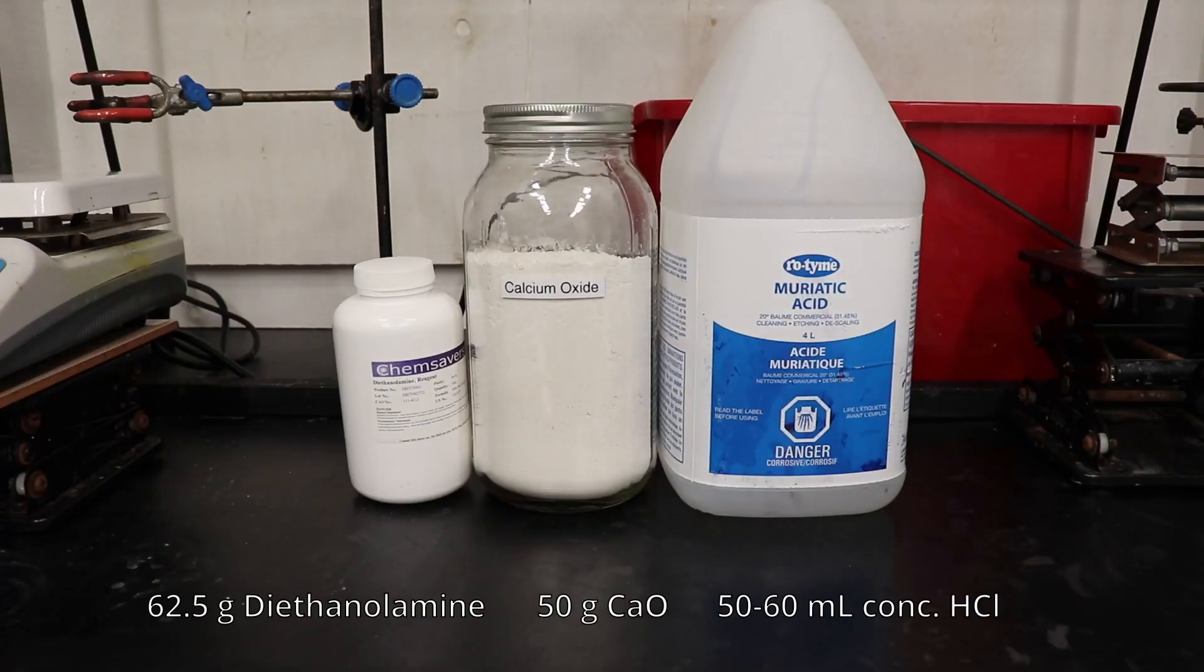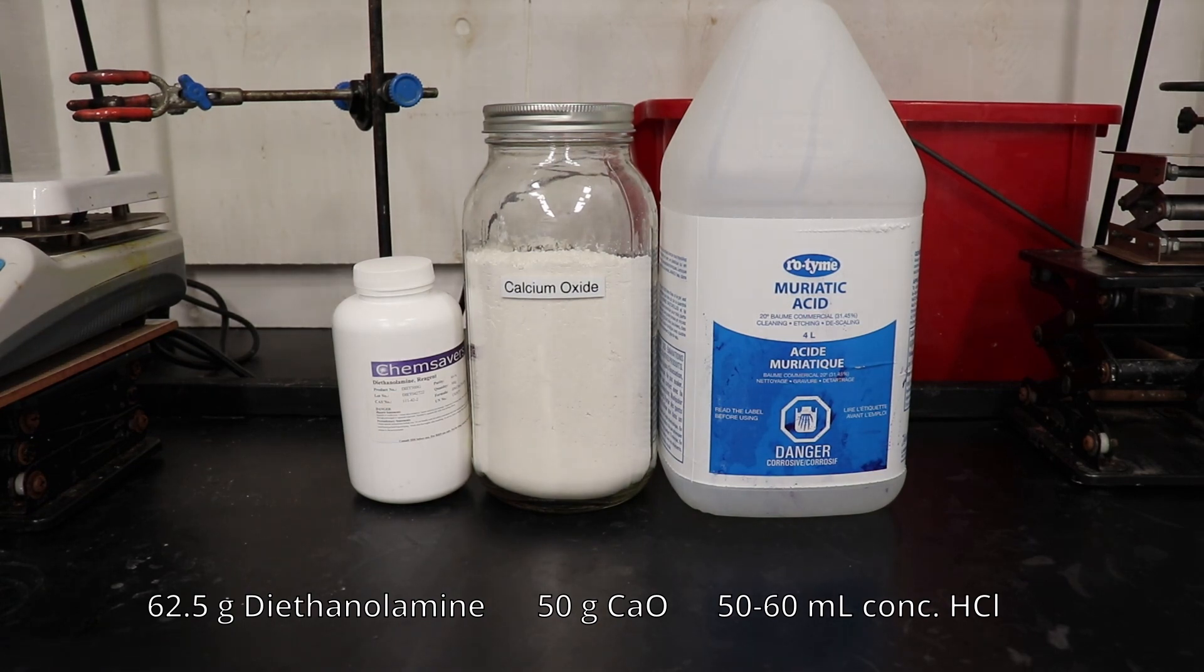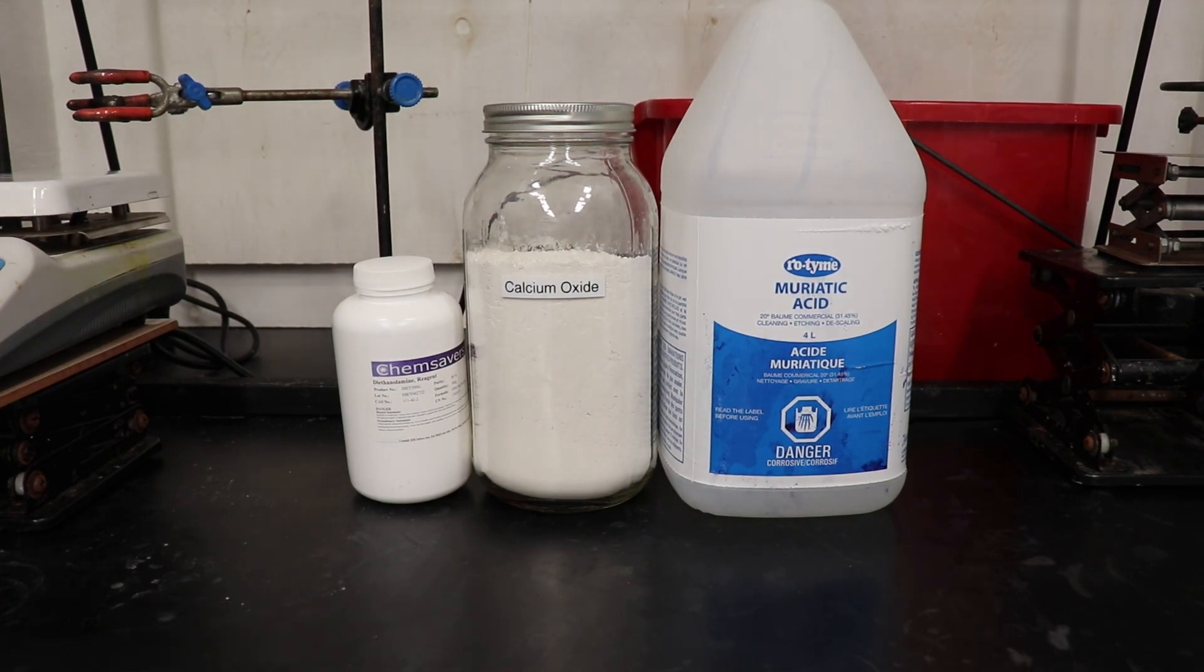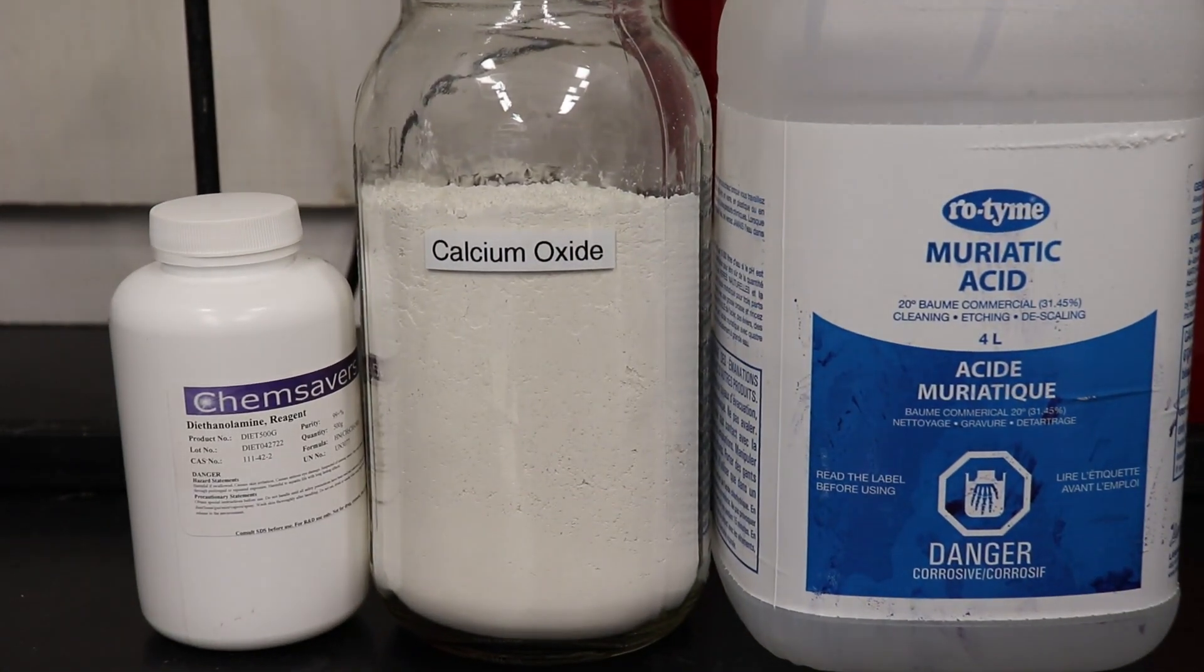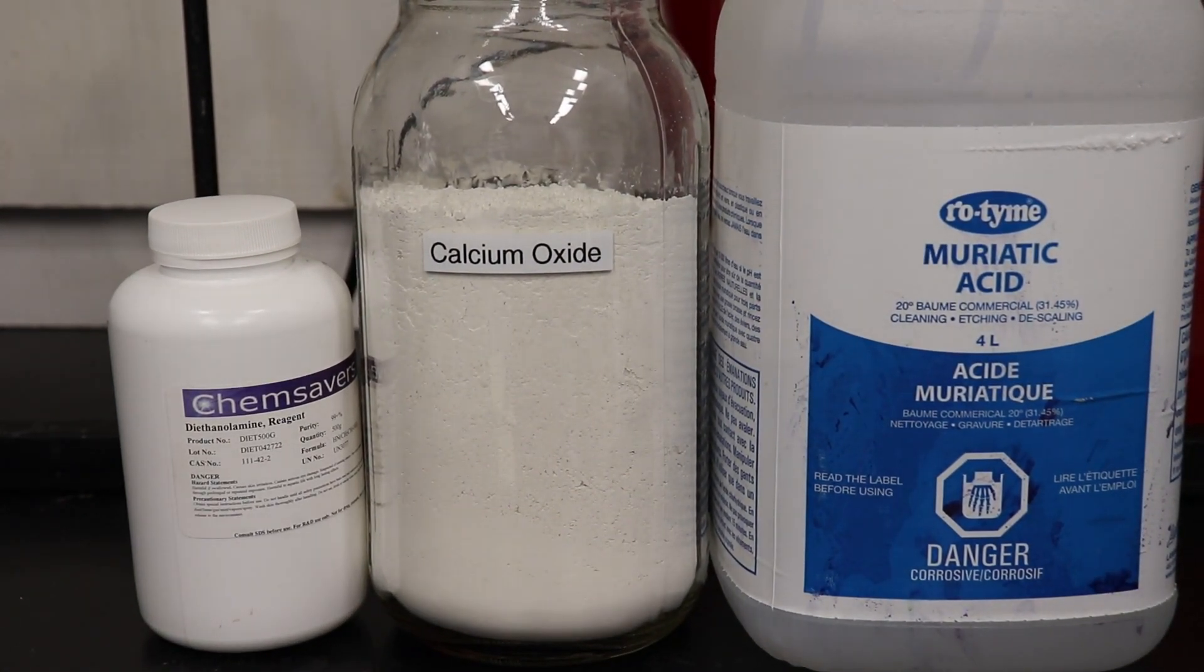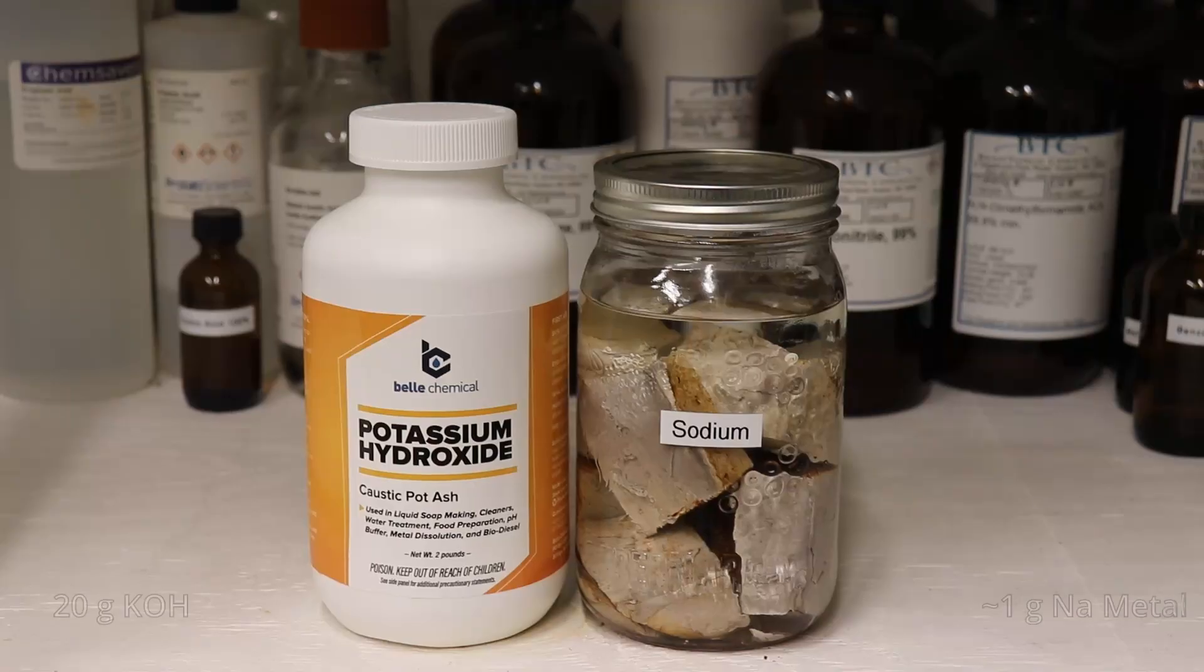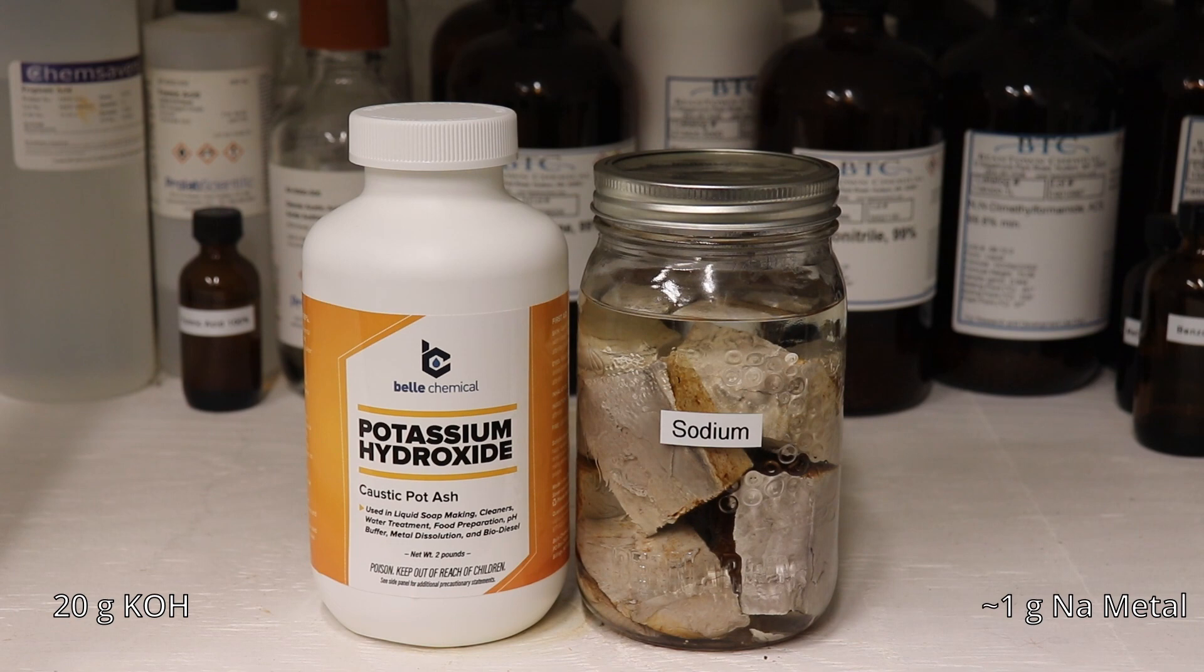Here are the main reagents used in this synthesis. Hydrochloric acid will be used to form diethanolamine hydrochloride, which will be heated and with the loss of water, cyclized into morpholine hydrochloride. The morpholine hydrochloride will then be free-based with calcium oxide and distilled off. The crude morpholine distillate will then be dried and purified by first stirring over potassium hydroxide, and then by refluxing and being fractionally distilled over sodium metal.